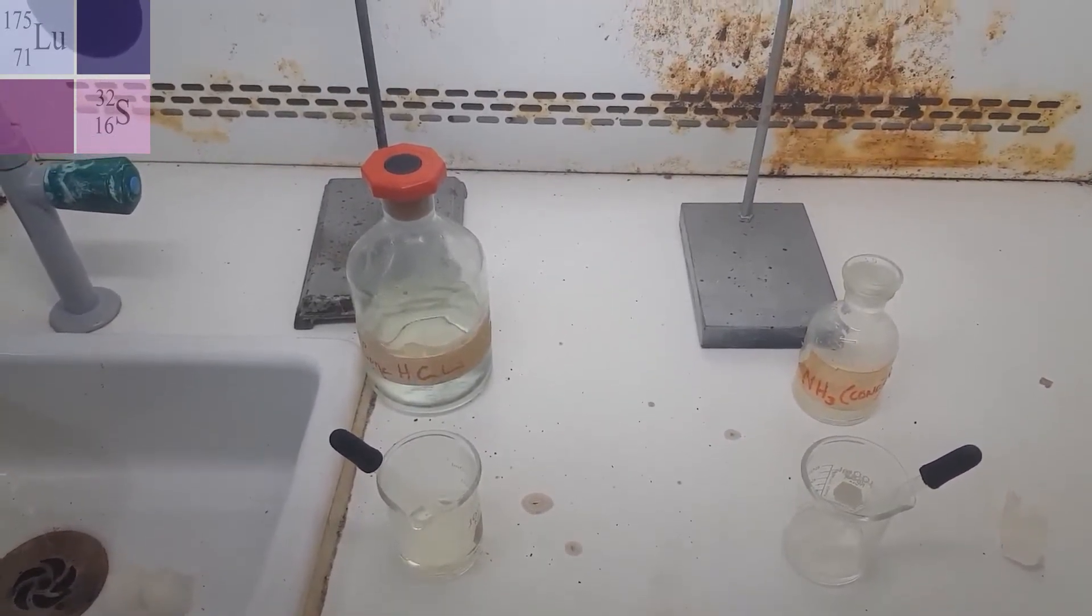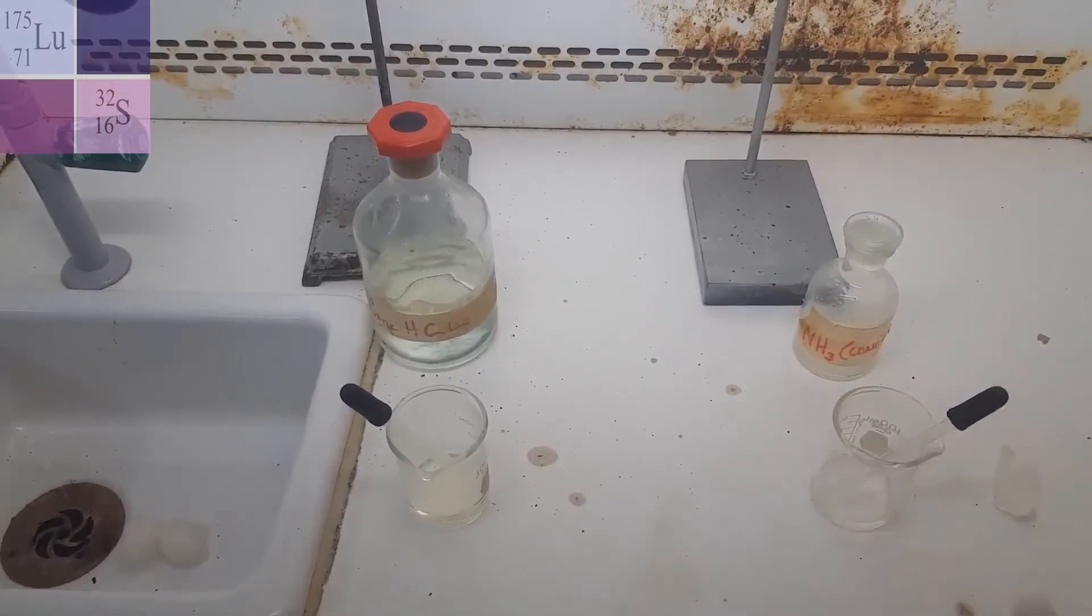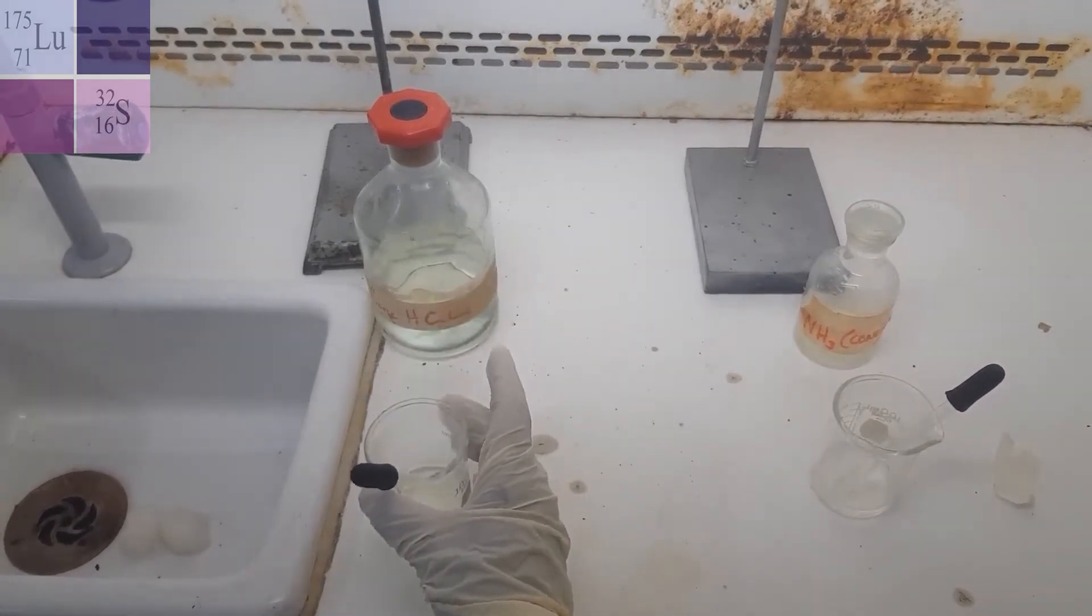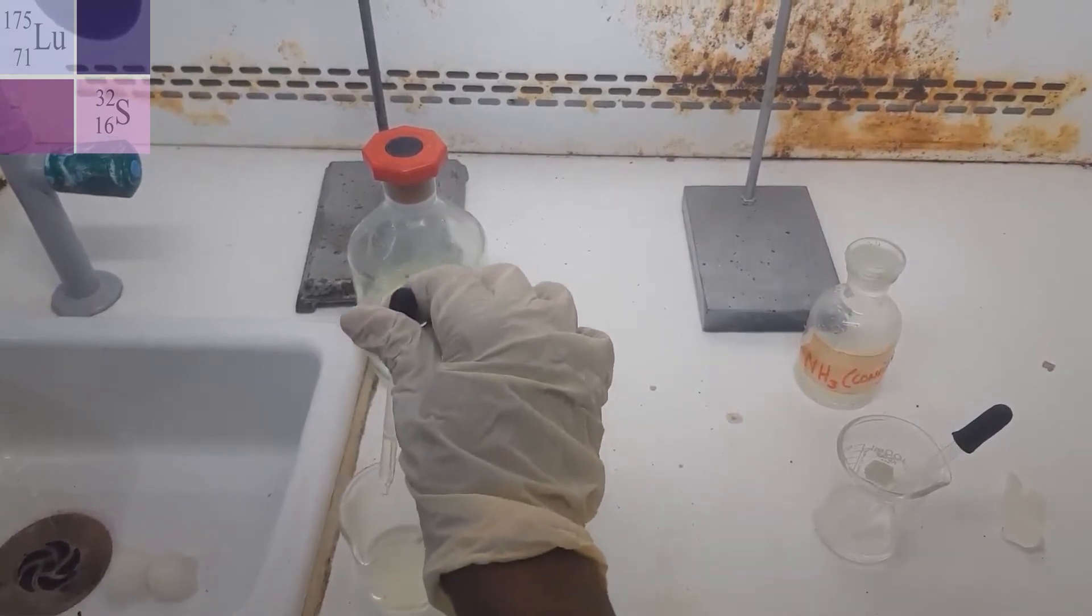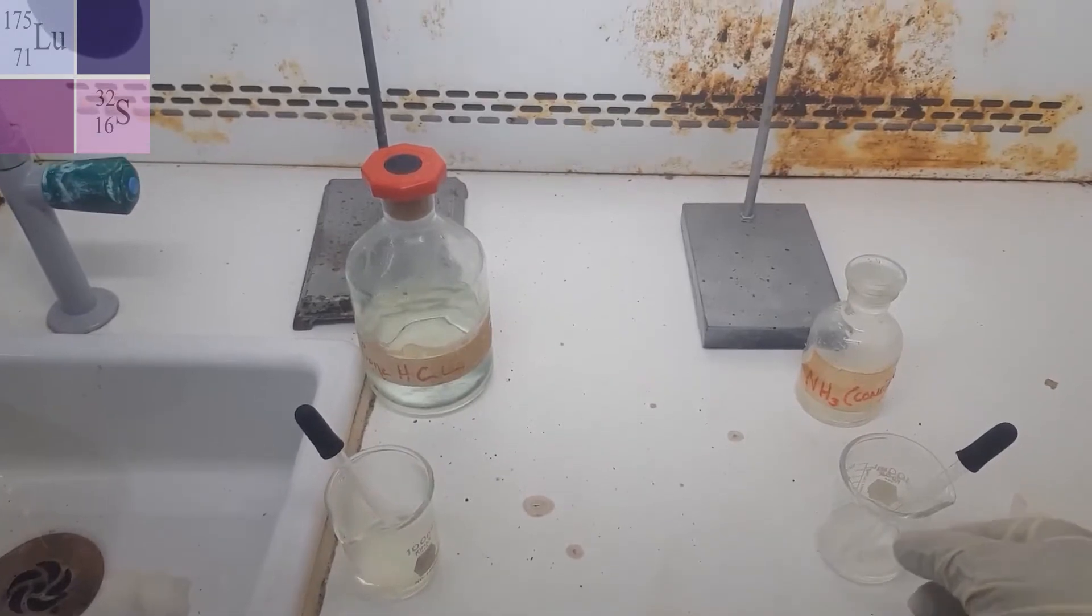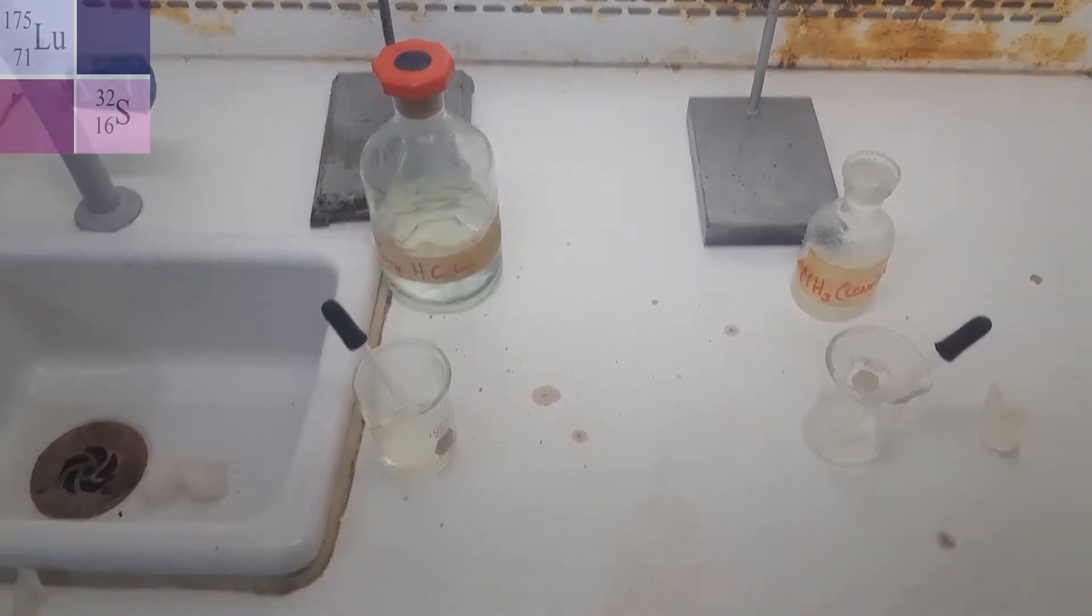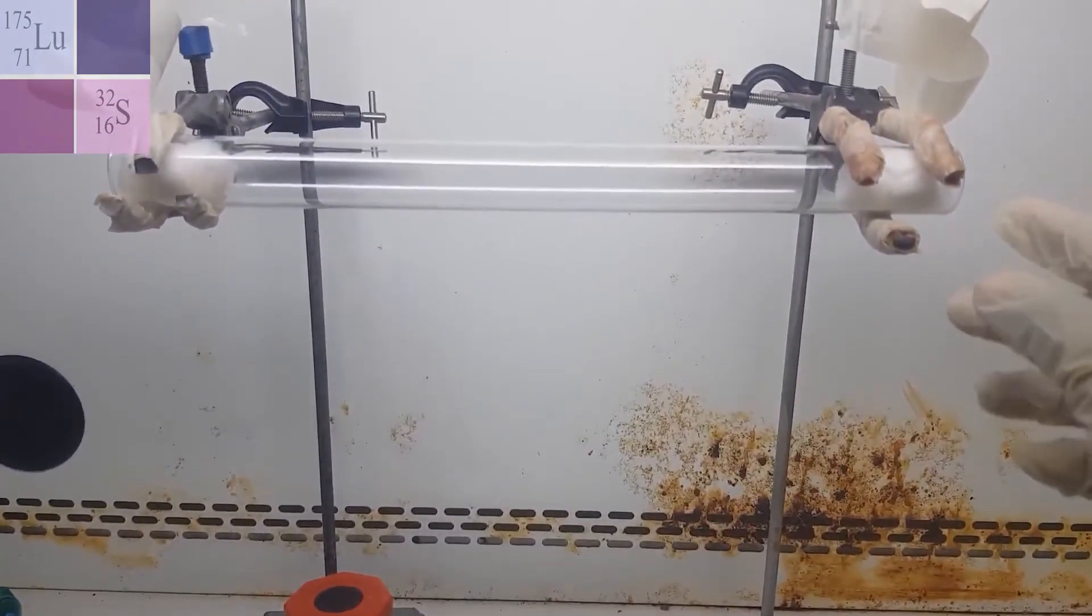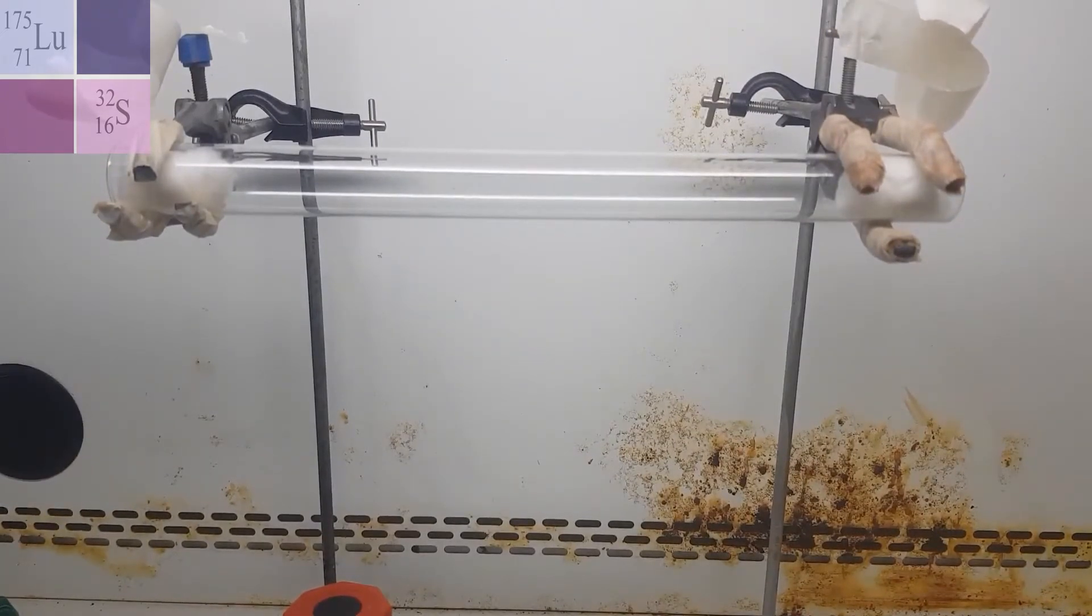So what I have prepared here is two beakers. This beaker containing the concentrated ammonia, dropper containing it, and this beaker contains the concentrated HCl, a dropper of that HCl. And what we are going to do, we are going to, at the same time, take each of these droppers and place a few drops of each substance into our setup here, but at the same time, because it's a race, we need the race to be fair.